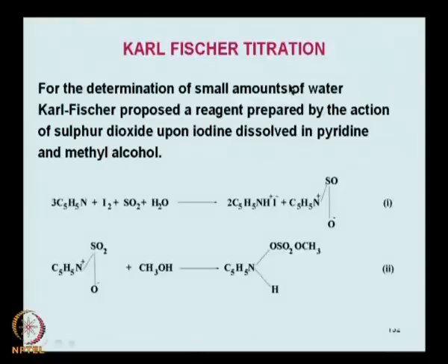So, now I want to turn your attention to the Karl Fischer reaction. The Karl Fischer reaction is a very beautiful way of determining the moisture content in a given sample. Suppose I give you any salt and you want to determine the moisture content in that. Normally, one would just heat it to about 100 or 150 degrees centigrade, remove the water by evaporation, dry it, cool it, and take it to a weighing machine to determine the difference and correlate it to the concentration of water present in the sample.